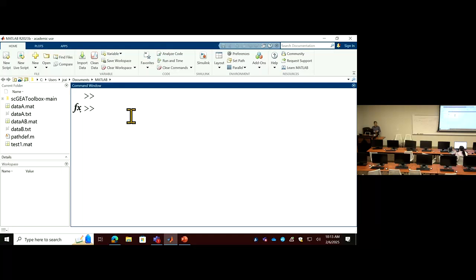I will define the names of the genes first. This is very easy. I have a small G, and I'm going to define a vector containing 3 elements. So this will be the genes, let's say, just A, B, C.